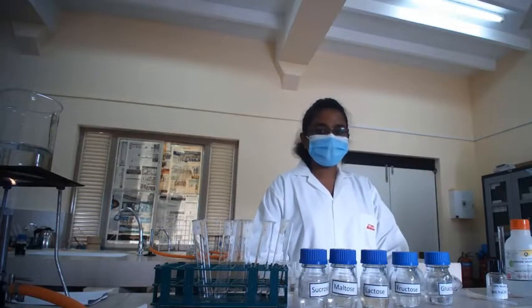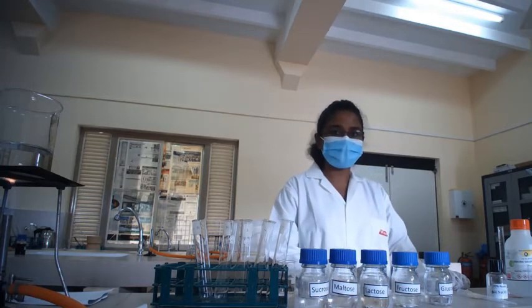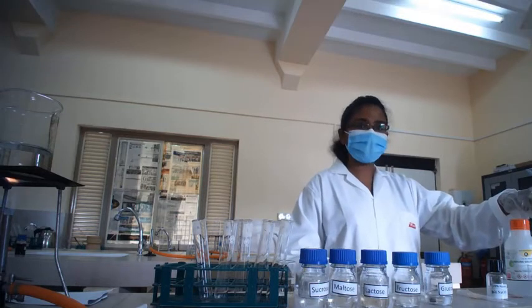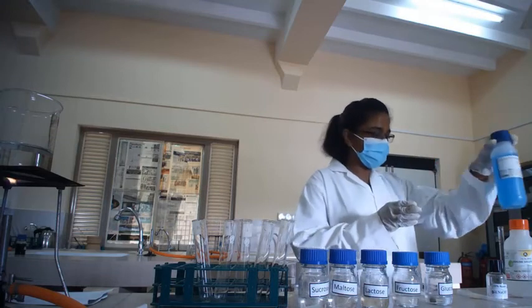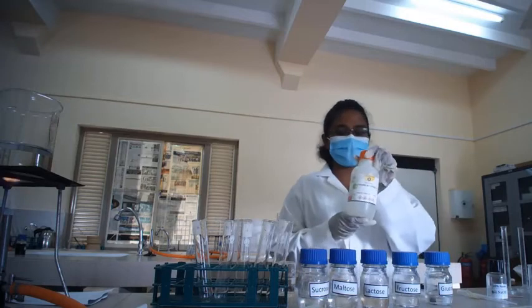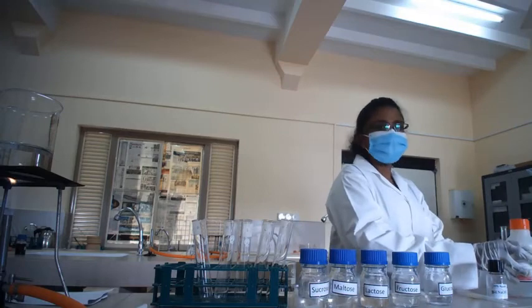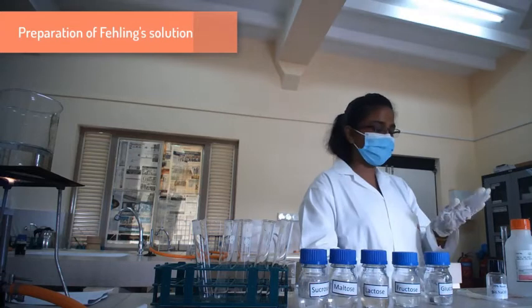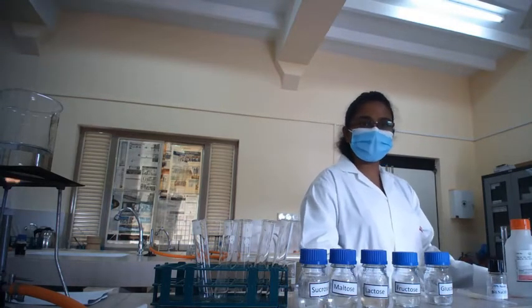Okay, now we are going to do another qualitative practical for the carbohydrates. It is the Fehling test. For that we need Fehling A, which has a blue color. As you can see, it is a blue color solution. And then we need Fehling B, which is a colorless solution, and we need distilled water. To prepare Fehling solution, we need 1 milliliter of Fehling A, 1 milliliter of Fehling B, and 2 milliliters of distilled water.